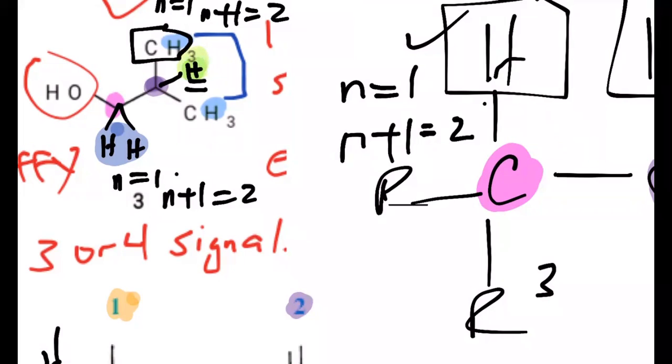Right there, you're looking at that one proton. How many neighbors does it have? Zero? Would it be no neighbors? No, it can't be none, because that proton is on a carbon, and next door to that carbon you have a CH3, and then another CH3, and you have a CH2. So it wouldn't be zero. It actually has 8 neighbors.